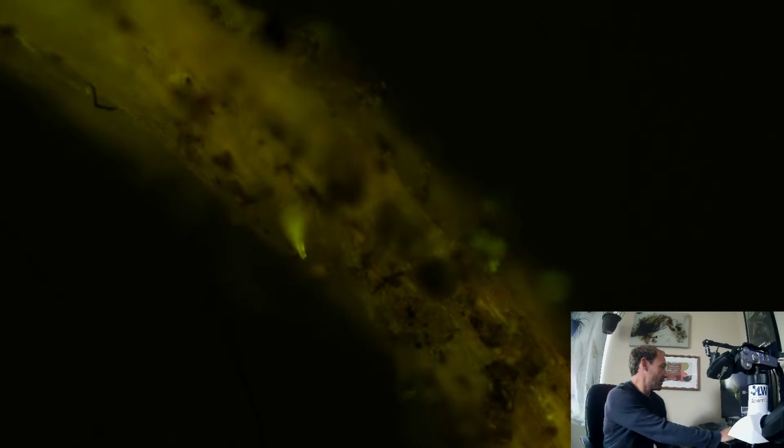I also got to bring up my chat so I can see what you guys are saying. Feel free to ask any questions about soil microscopy, or you can ask questions about regenerative soil and practices like that.